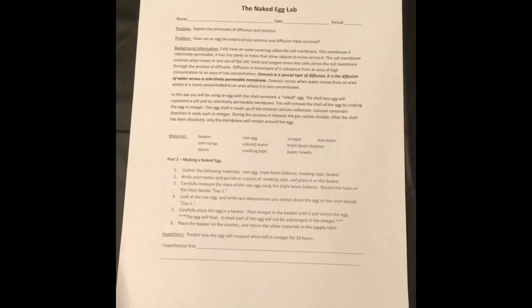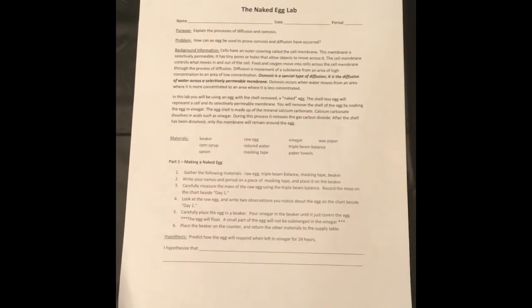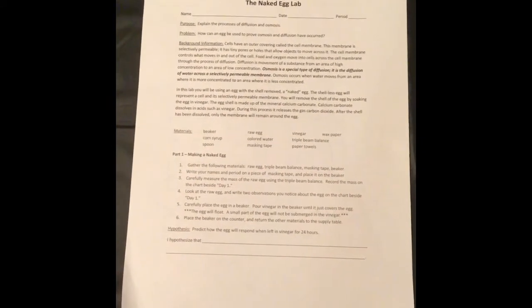Our materials are a beaker, corn syrup, a spoon, a raw egg, vinegar, wax paper, a balance, and then paper towels as needed.